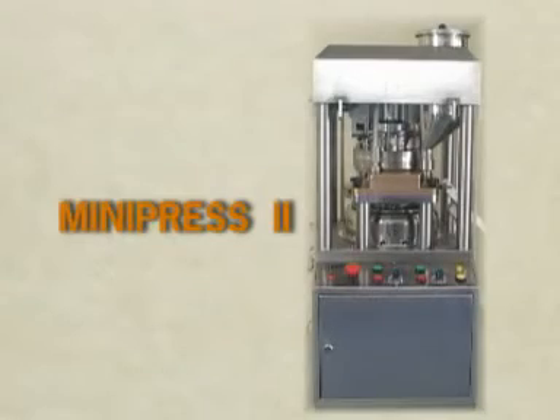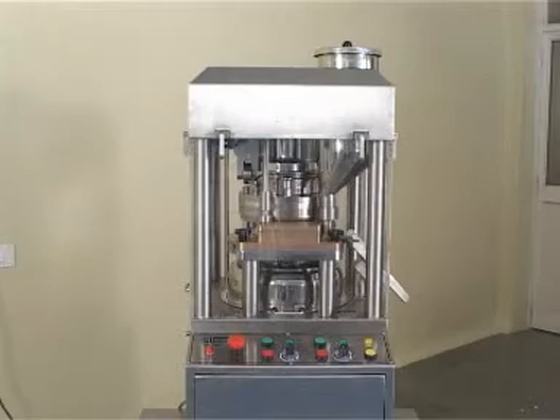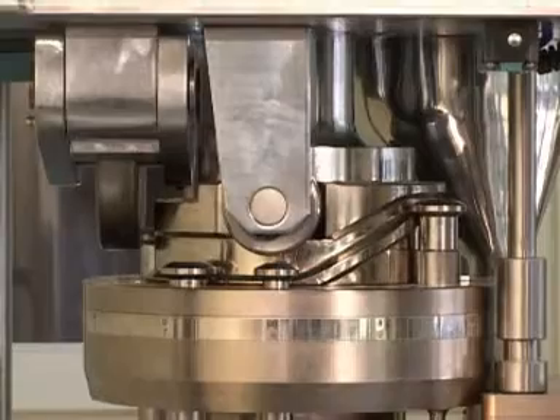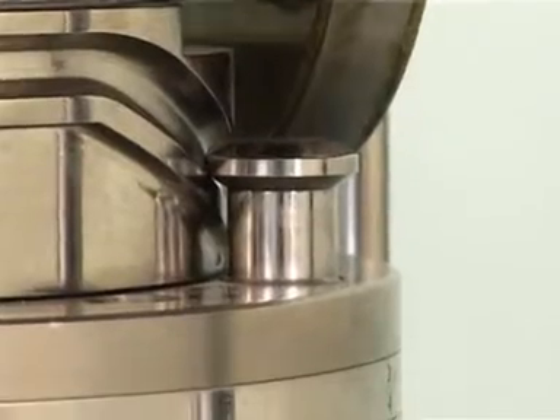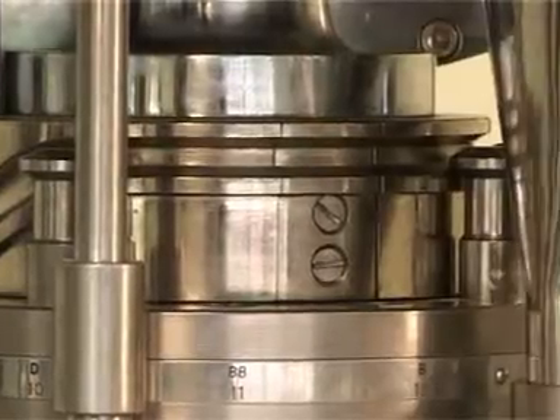Mini Press 2. The Mini Press 2 is a sturdy, single-sided rotary tablet press designed with GMP considerations with in-built pre-compression. The Mini Press 2 is the most compact and easy to use for laboratory use, for R&D and small batch production.